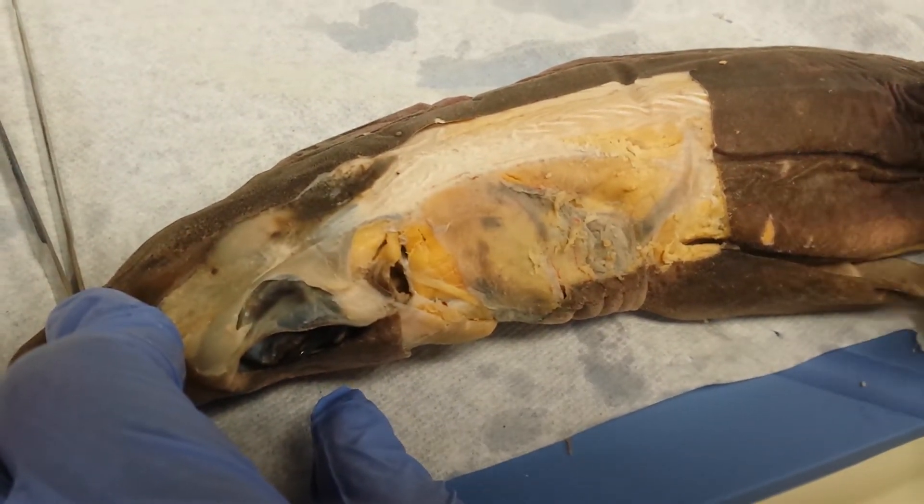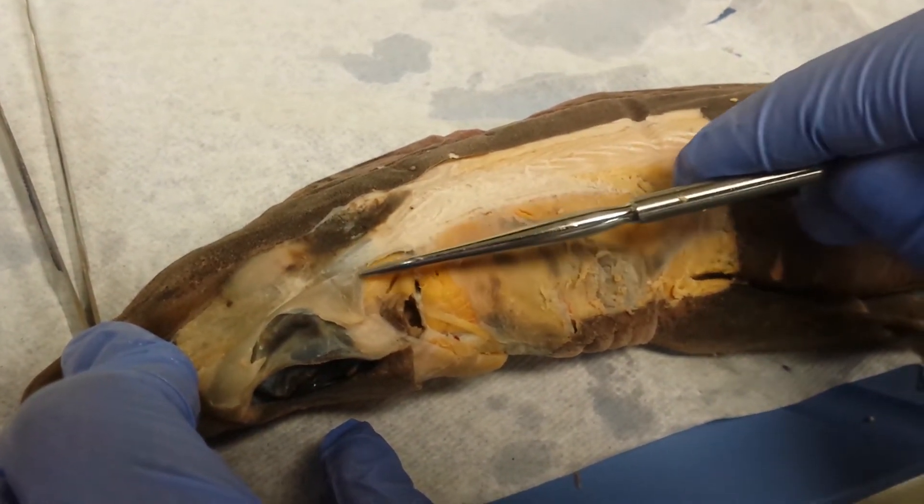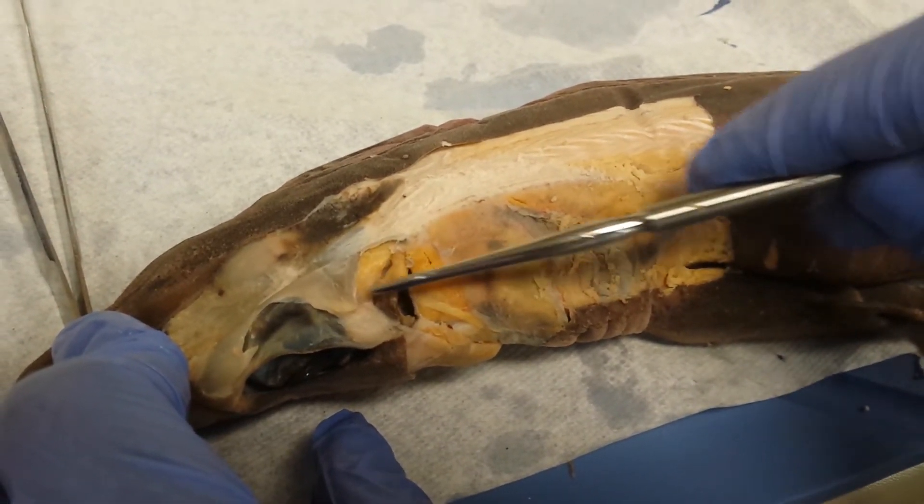So those are the dorsal muscles. I'm going to start at the front with the palato quadrati. Palato quadrati are square-shaped muscles, and it's anterior to the spiracul.